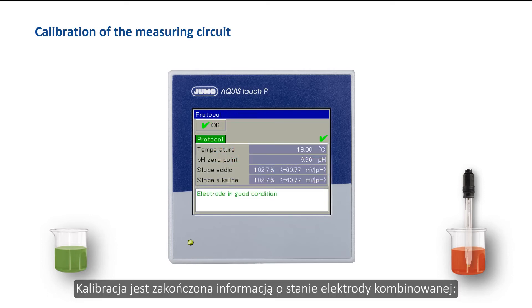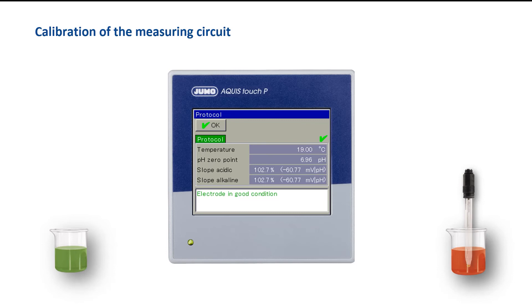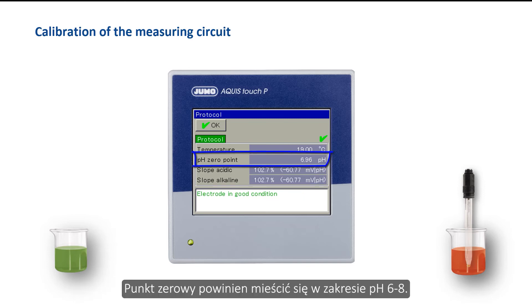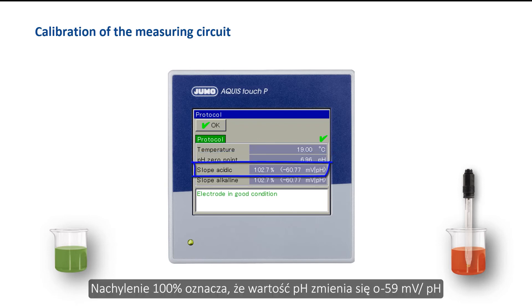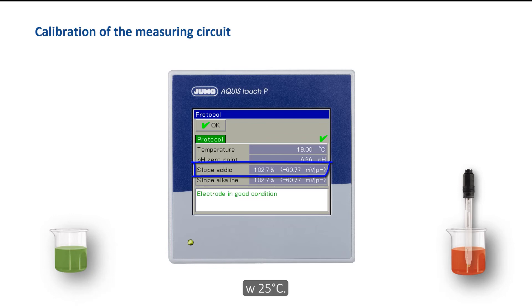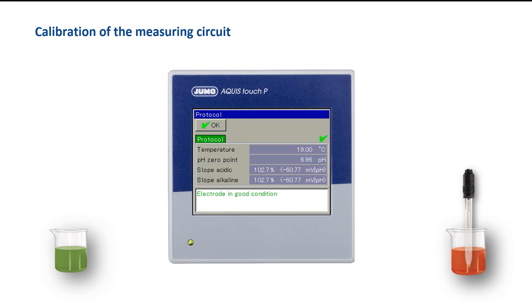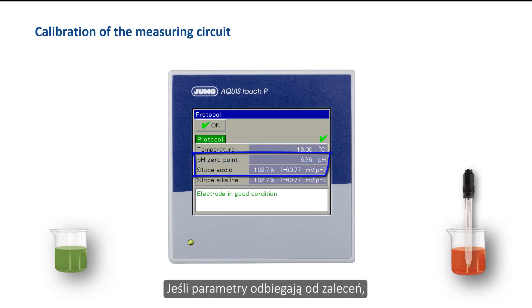The calibration is completed with information on the state of the combination electrode. The zero point is the pH value at which the electrode outputs 0 mV, and it should be within a range of pH 6 to 8. A slope of 100% means the pH value changes by minus 59 mV per pH at 25°C; the slope should be at least 90%. If the parameters are outside these recommendations, the combination electrode should be replaced.